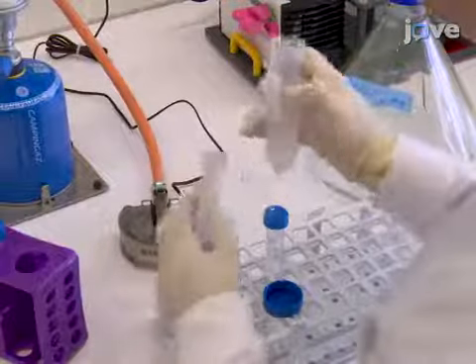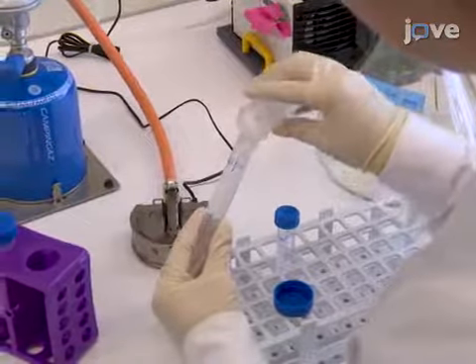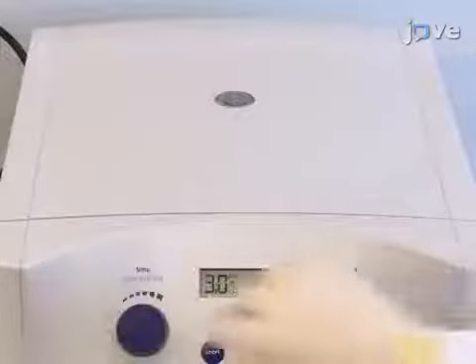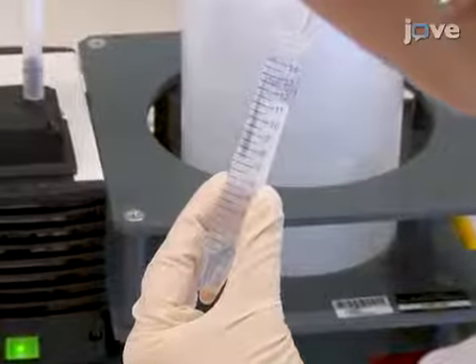Take the L1s out of the 25 degrees Celsius incubator and transfer them to 15 milliliter tubes. Centrifuge the L1s at 1900 times G for 3 minutes. After spinning, remove the supernatant.